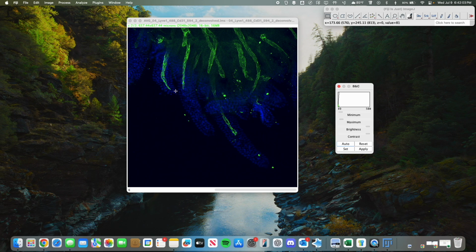So all the lacteal ratios are is a measure from the base of the villus to the tip of the villus. So in this case, I'll just go ahead and start with this one because it's the first that we can see. This left one, the villus is cut off, so it's not very usable for quantifying this ratio. So we're going to start around this point. So it's where the base of this villus is, and we're going to just draw a line through the tip. And then the second time we go through, we're going to approximate the same spot, and we're going to do it to the tip of the lacteal.